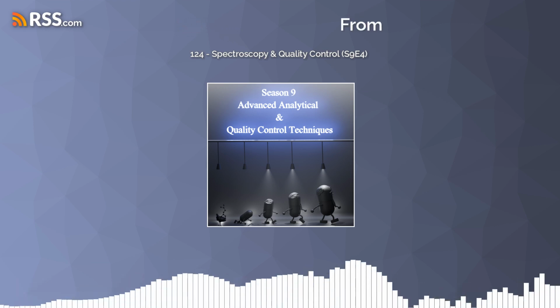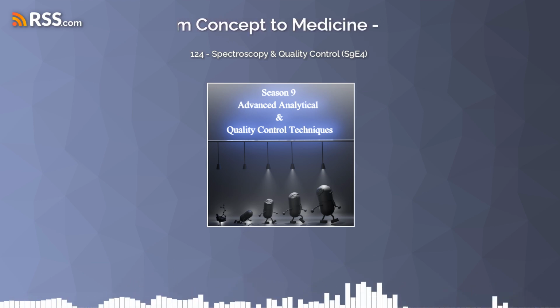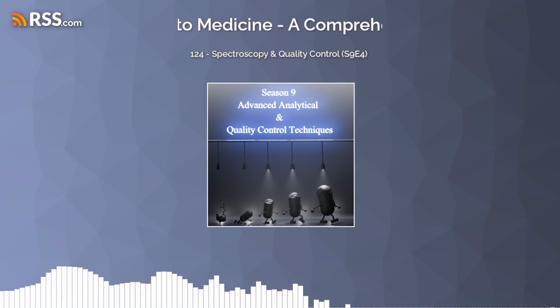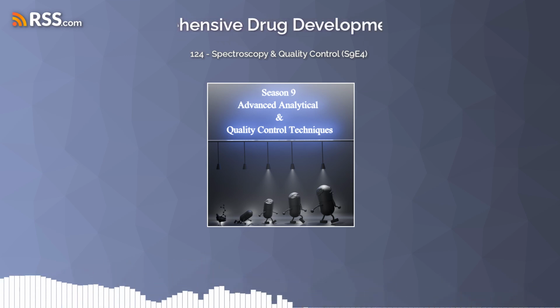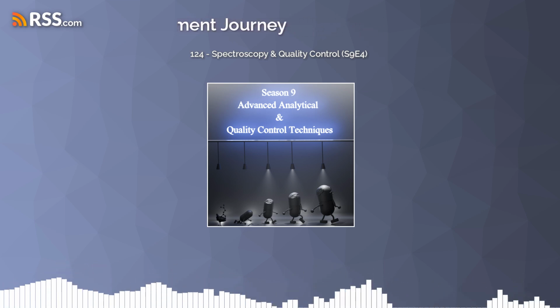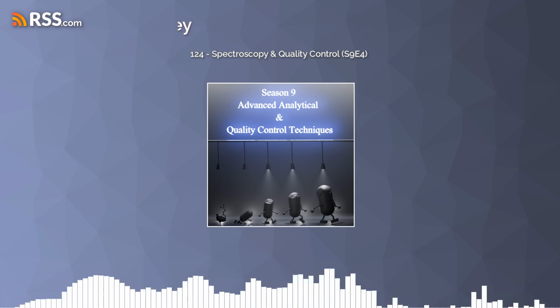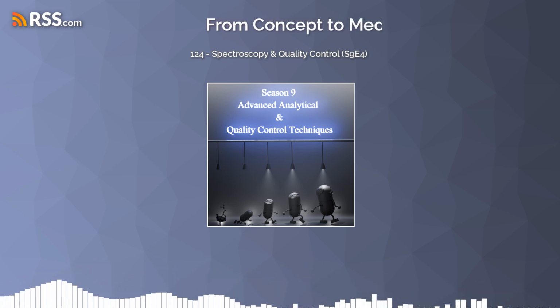Absolutely. Okay, how about an example with Raman in a manufacturing setting? Let's say you're making tablets in a continuous manufacturing process, and you're using Raman spectroscopy to monitor the drug content in the powder blend as it's being mixed. And let's say the Raman spectrum starts to show some deviations, meaning that the blend is not homogeneous.